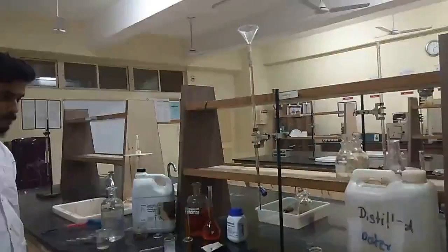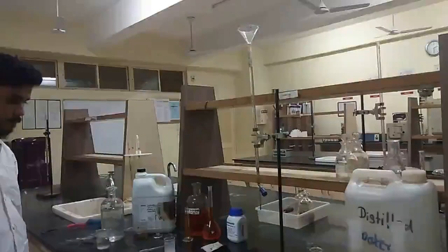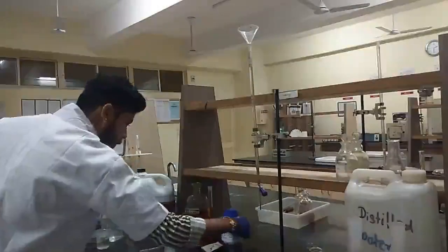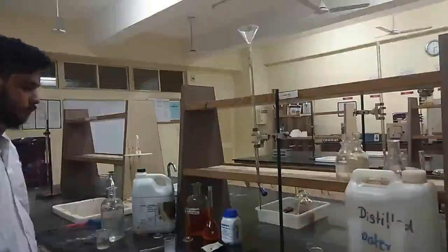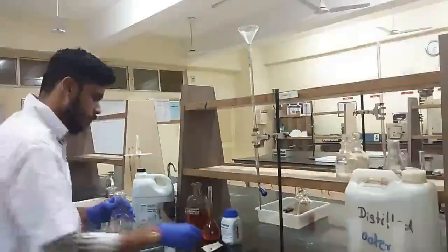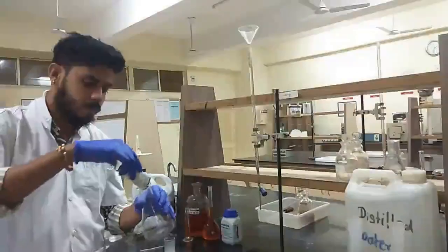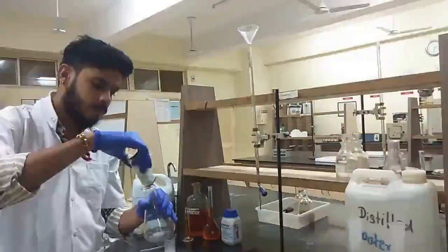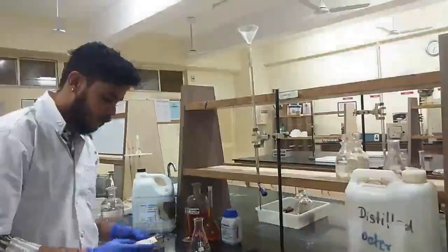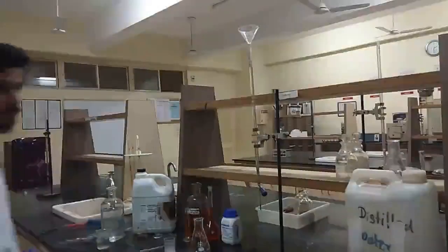For the standardization process, we require firstly 2 gram of potassium iodide, that is 2 gram of KI, which we have already weighed on the weighing machine. Now that we will be adding to our conical flask. After addition of 2 gram of KI crystals, we are going to add 100 ml of distilled water.